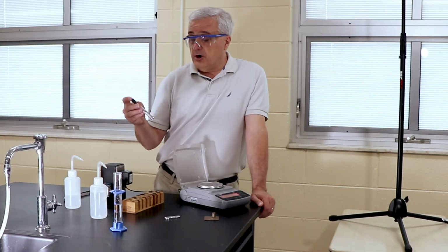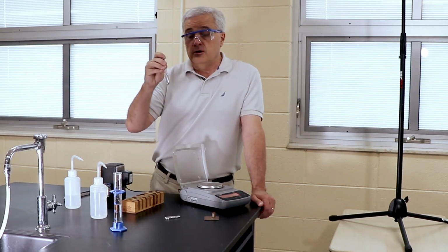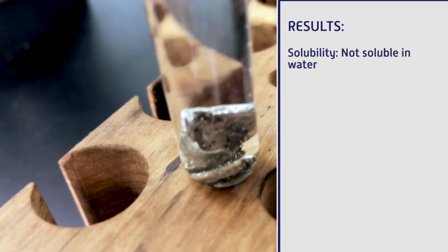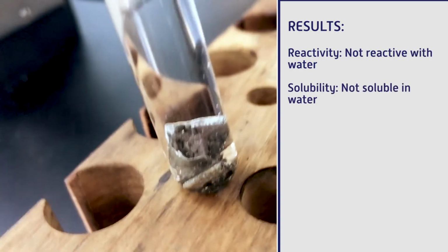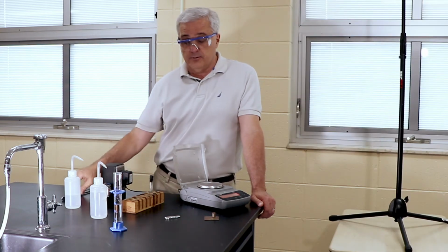So with regards to the results, solubility with water: we did not notice any solubility, any dissolving, so we're going to say it is not readily soluble in water. And with regards to reactivity with water, also not readily reactive. We did not notice any reactivity in the course of the experiment.